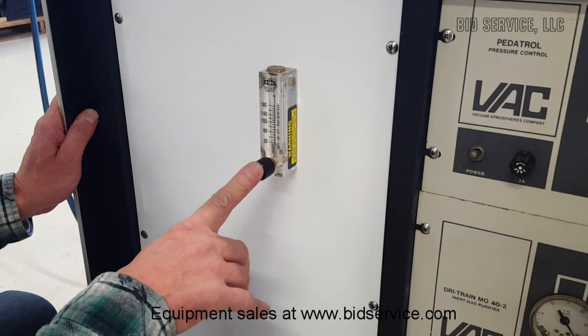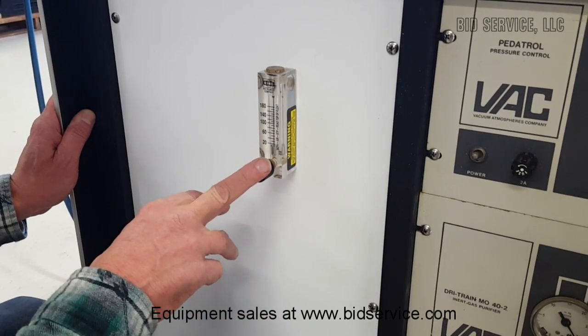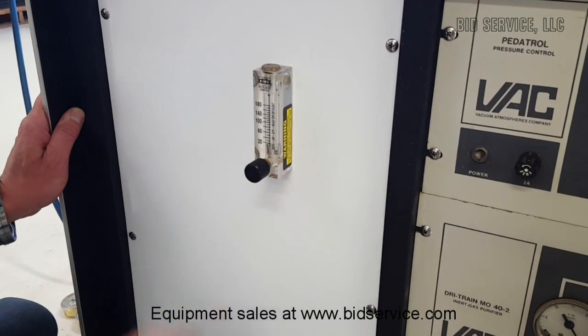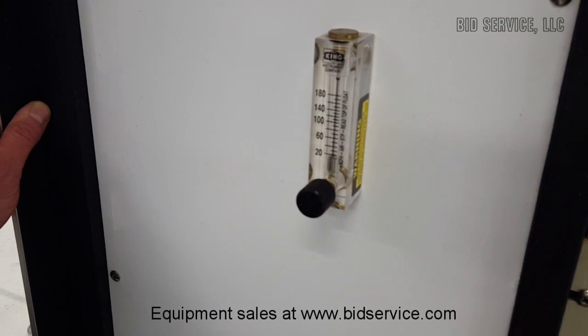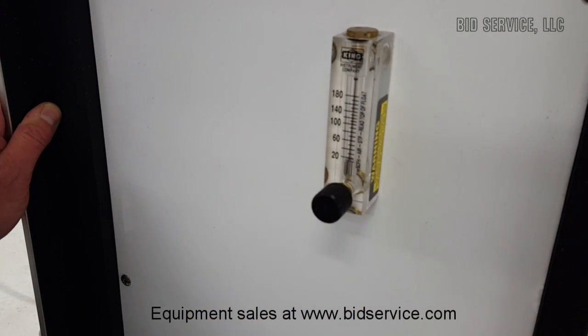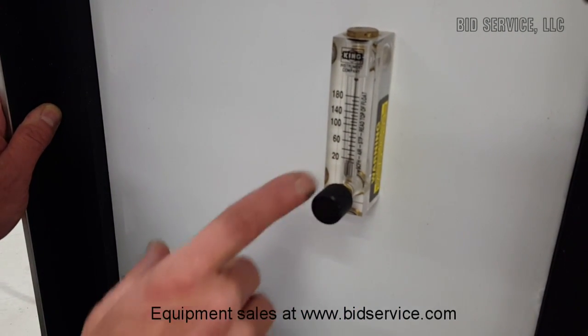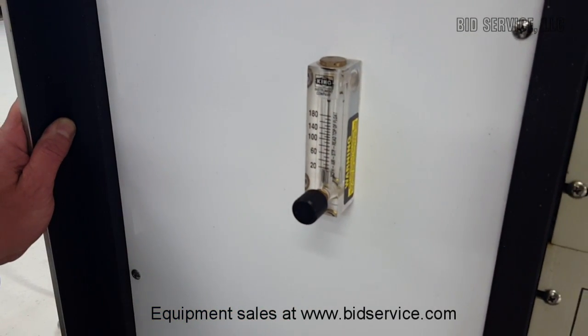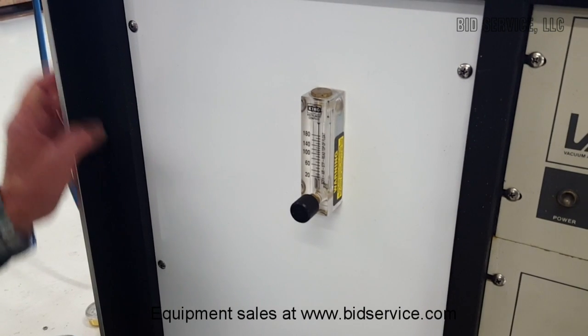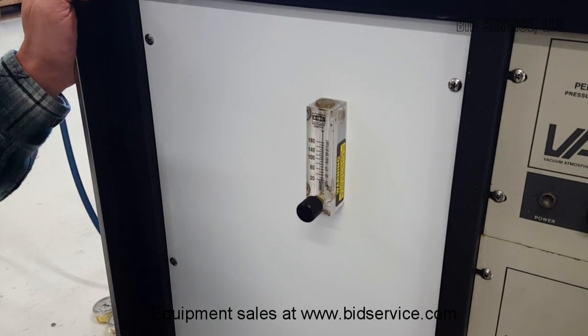This is your flow meter for during the regeneration cycle. You can adjust your flow — generally we set that at 60 standard cubic feet per hour. This is the regen gas that goes through during the first purge of the regen cycle, which again is nitrogen with 5% hydrogen.